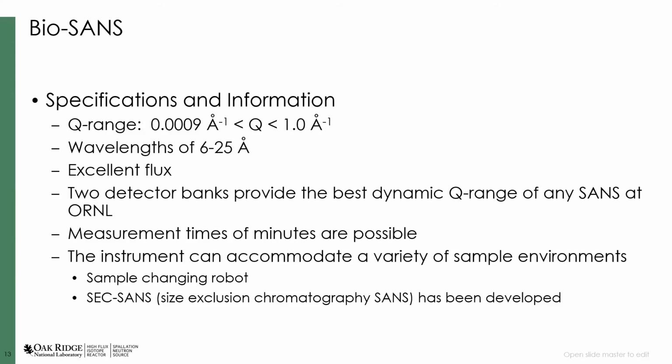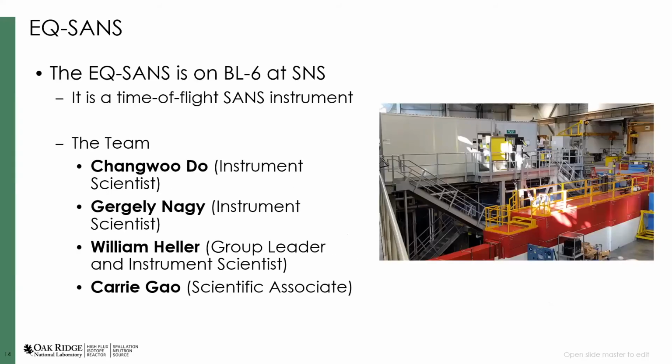They have also developed size exclusion chromatography SANS, which is very common now on synchrotrons. I think this is a great development that this team has implemented finally. Not finally, they've been working on it for a little while, but it's a very good thing. It's very beneficial for that community who does biological solution scattering.